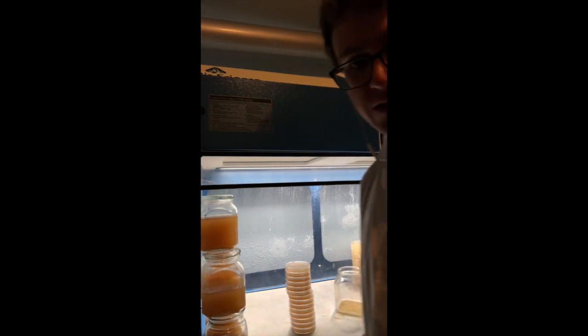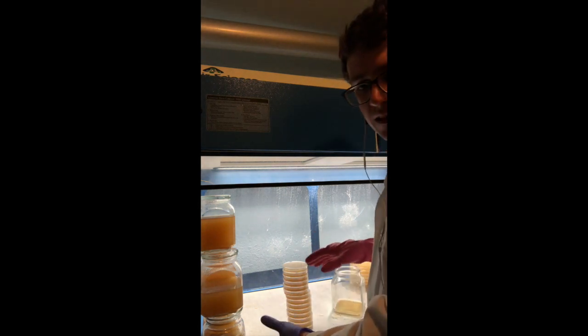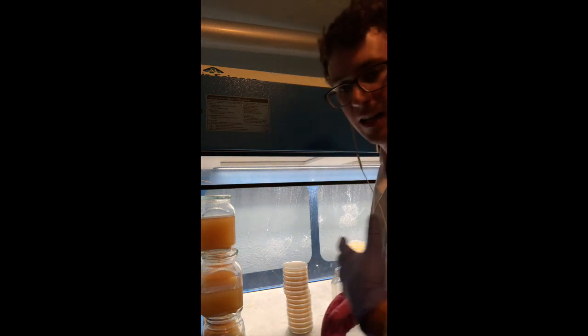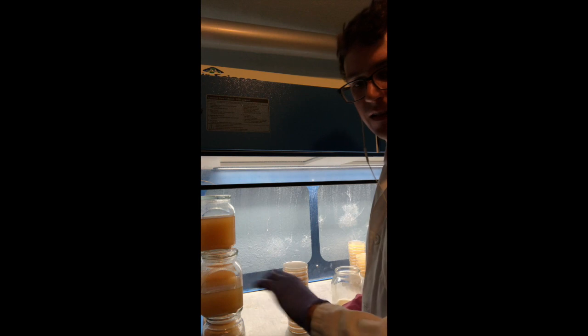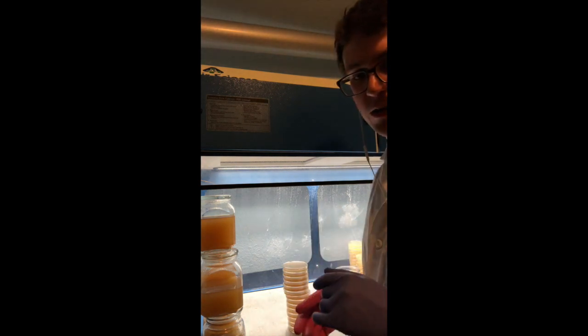There you have it. Two different ways how to pour plates. You can either spread them out and pour them and let the steam evaporate, or do them in a stack, which as long as it's not cooling off, then it should be fine. And you can always tap the plates on their side while you're putting them in the sleeves, and that will help mitigate condensation, but I'm gonna go ahead and pour the rest of these plates before this agar cools.